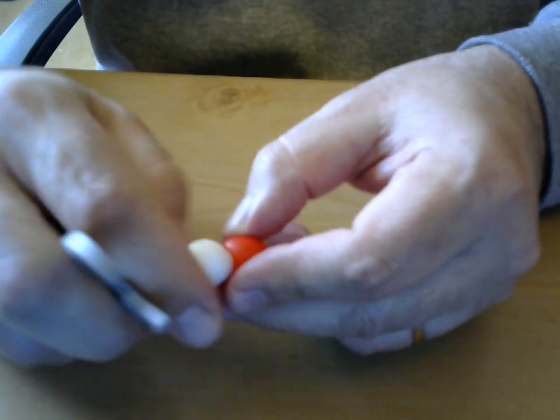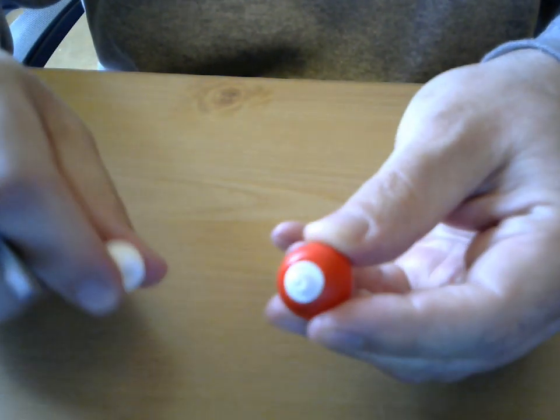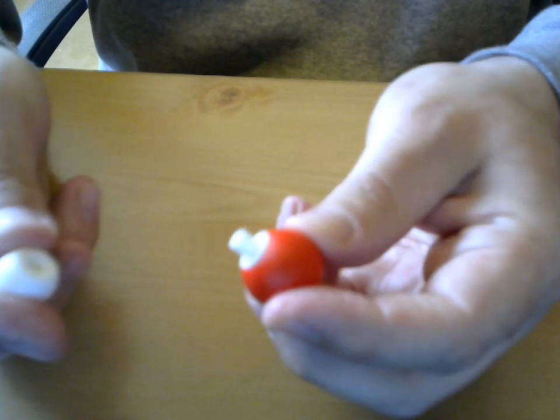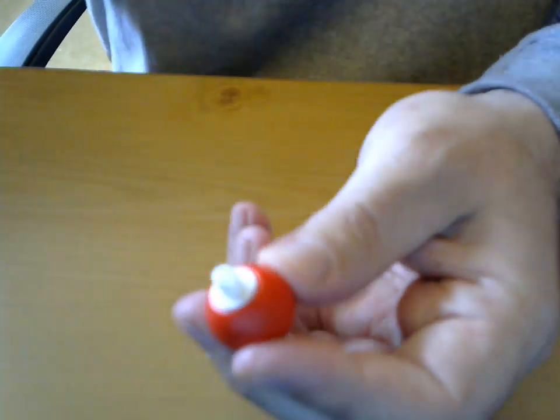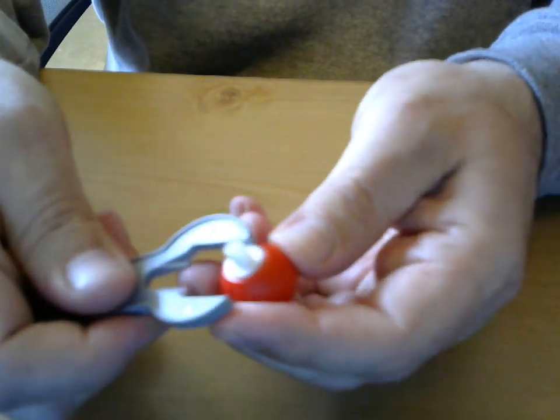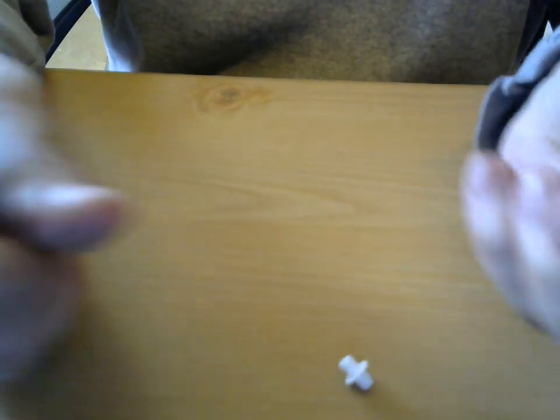Could I use a short single bond? Yes, I could use a short single bond. And if we were in class, I would teach you that this is the reason why I don't use them too much, because when I take them apart, you see how it's always stuck? And it's tough to get it out with just your fingers, so then you got to use the tool. And the tool will pop it right out of there for you.